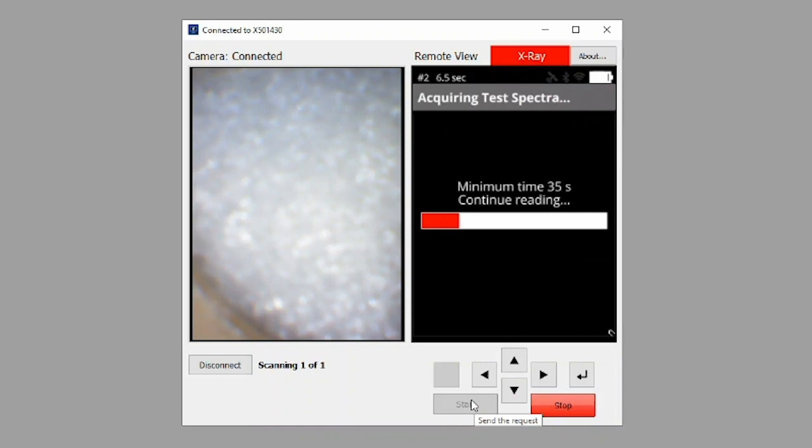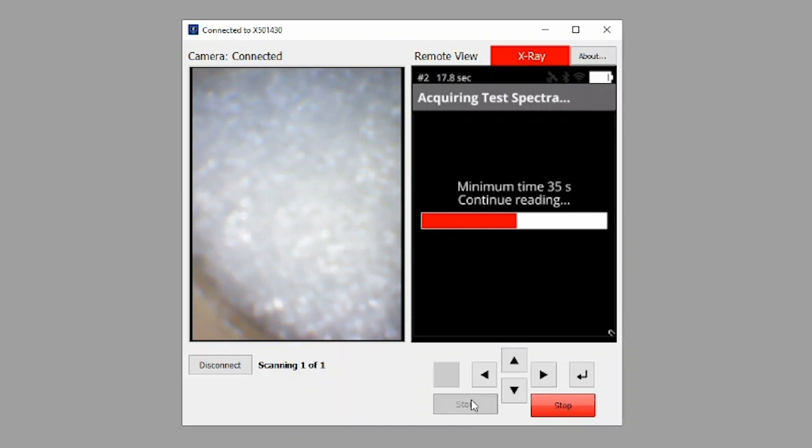Typical analysis time takes about 35 seconds to complete. During the measurement, do not open the top of the sample compartment, otherwise the test will abort. Once the test is completed, the result screen will be displayed.